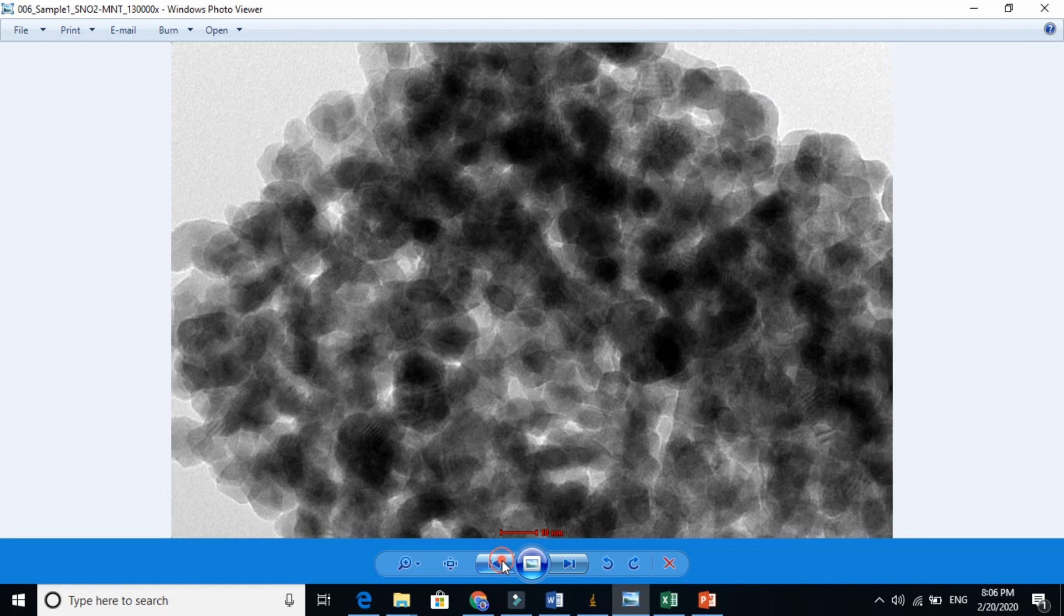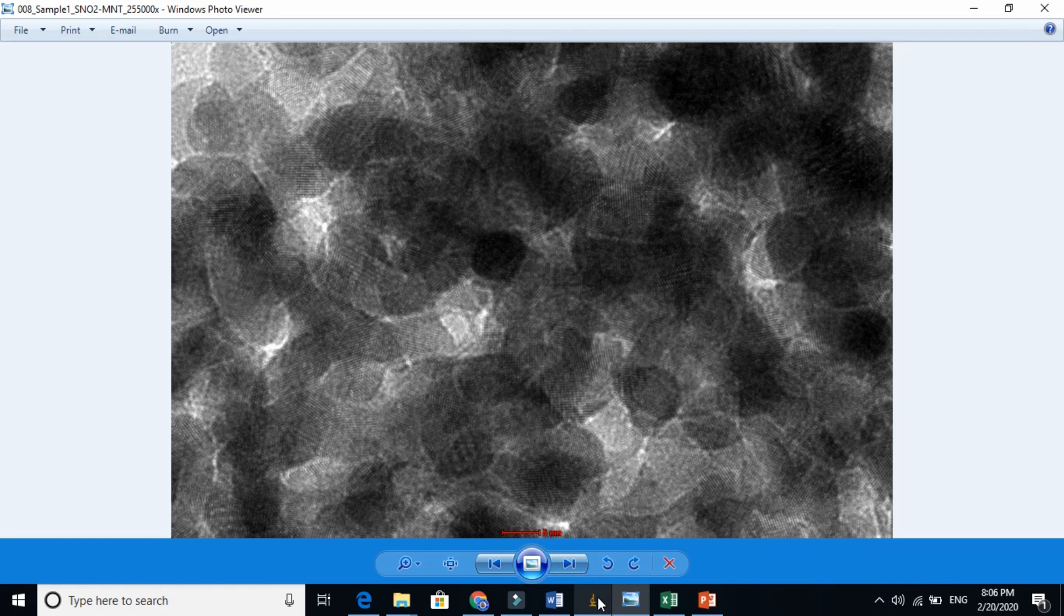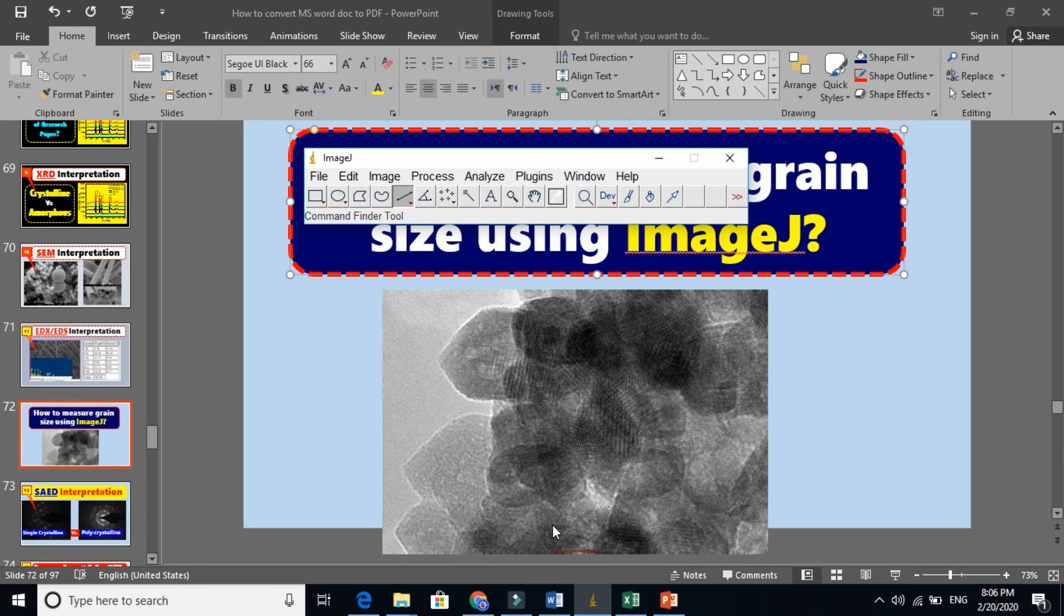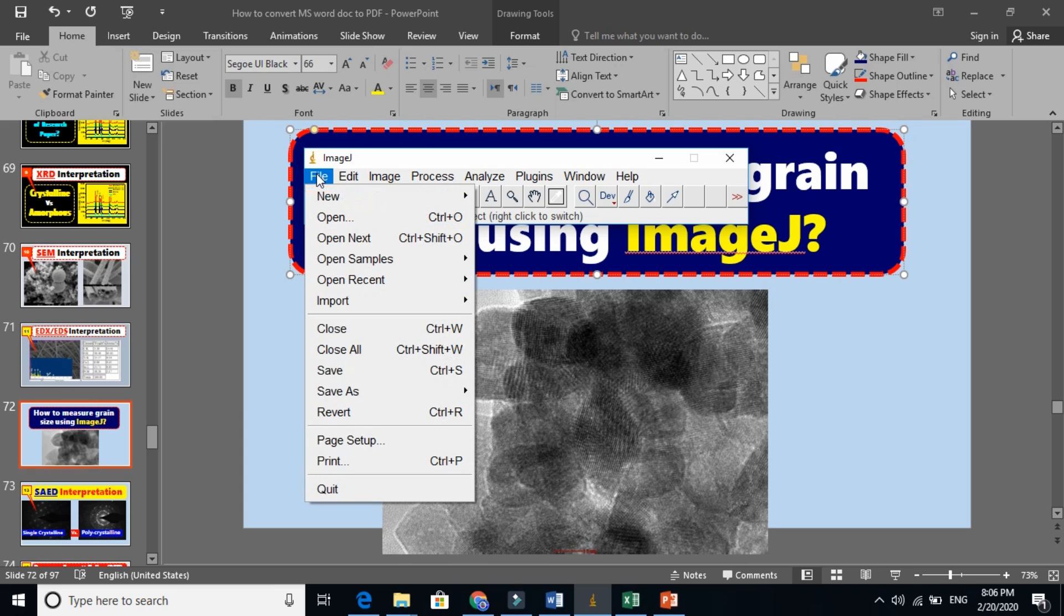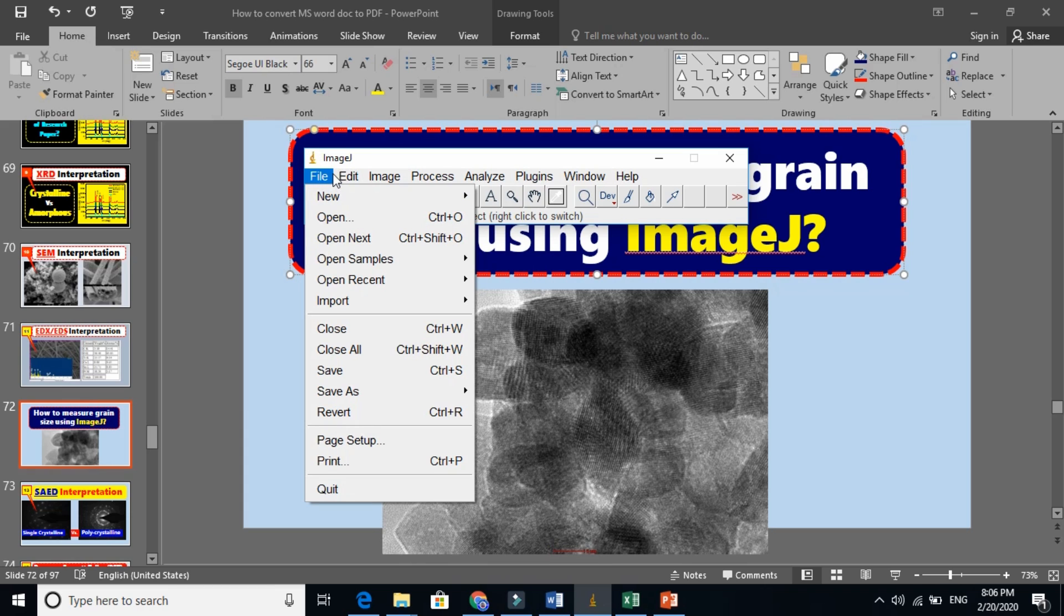And I know that the grains are varying, so we will find every grain size. So this is a basic software. The first thing you need to do is import an image in this software. It will not work, you need to import first.